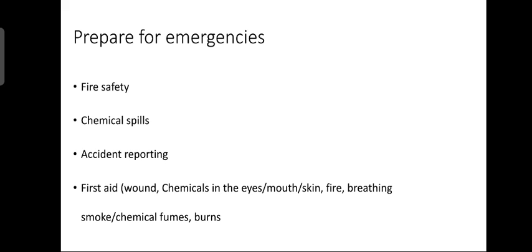On seeing the fire, alert others by shouting fire, fire, fire repeatedly. Stay calm, do not give rise to panic. Judge the type of fire, use the right type of fire extinguisher. Fire, depending on its origin, is classified as class A, that means combustible materials, that is wood, paper or furniture, etc. Class B, flammable liquids. Class C, flammable gas. Class D, metal fire. Class E, electrical equipment. Class K, oil and greases.